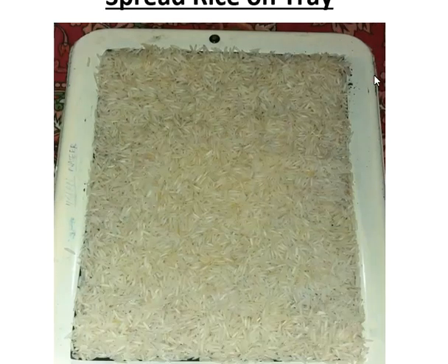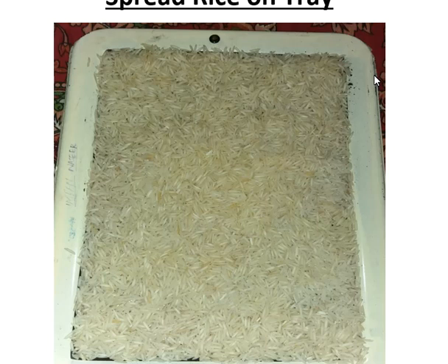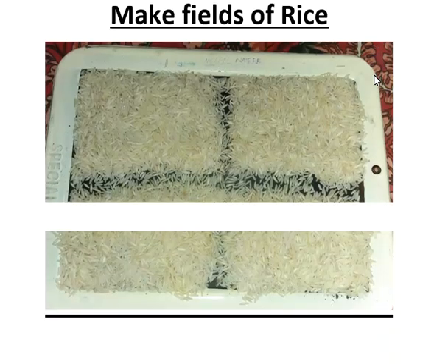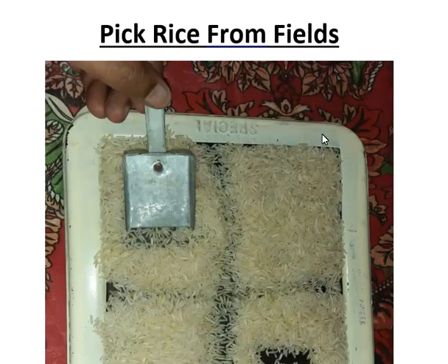Now the actual process begins: spread the sample on the tray in a level so that it can be picked easily by the rice picker. In the next step, you divide that rice into four different fields. This makes it easier to carry the sample and to take a random sample from each field.